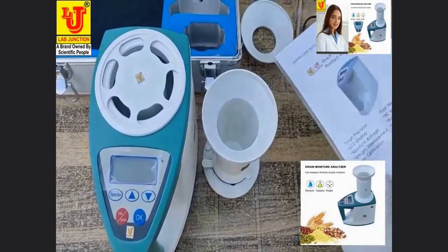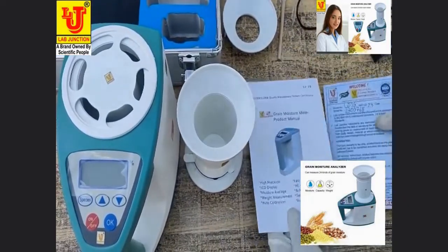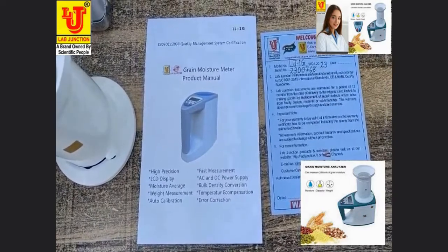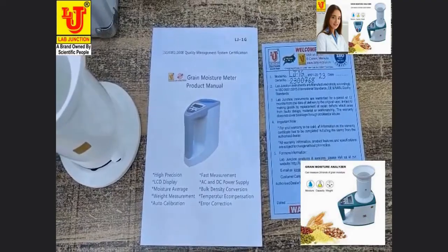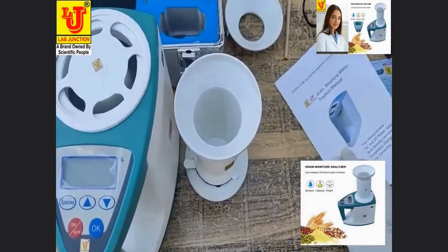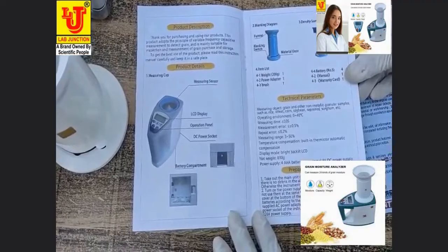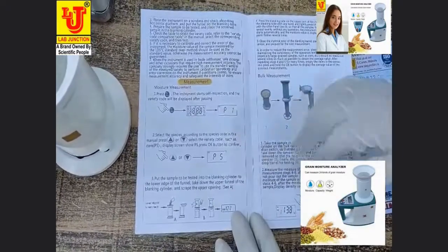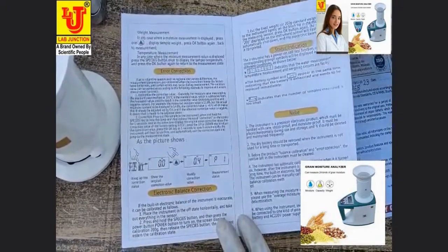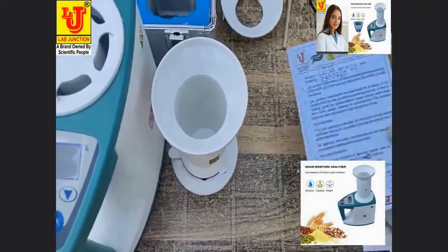The accessories are: this is the instruction manual, with a one-year warranty card. How to operate the grain moisture meter — all are described in this instruction manual. One year warranty card.